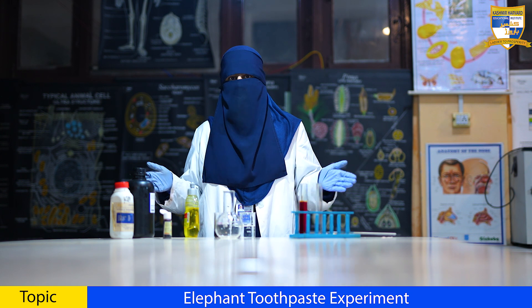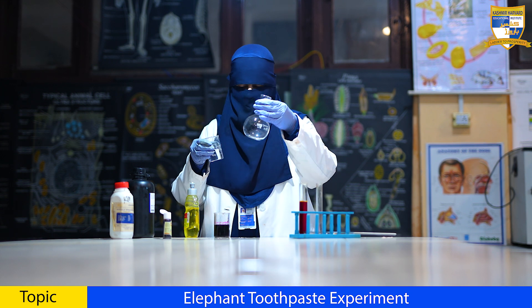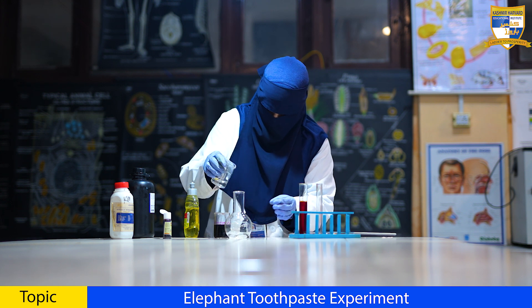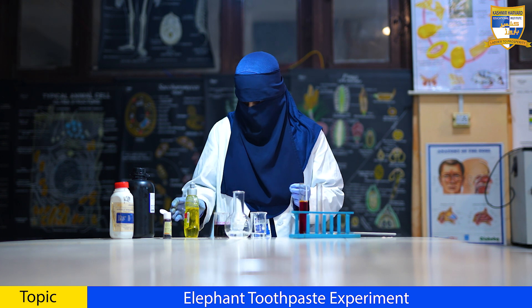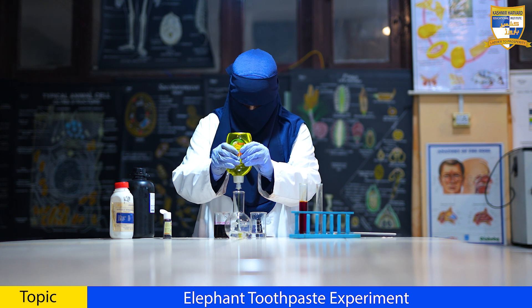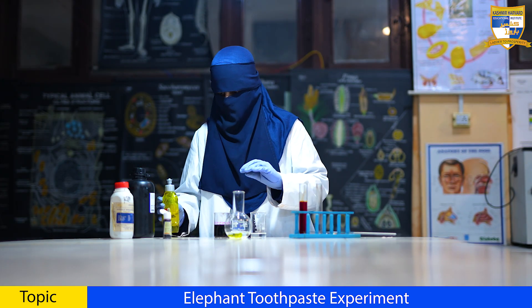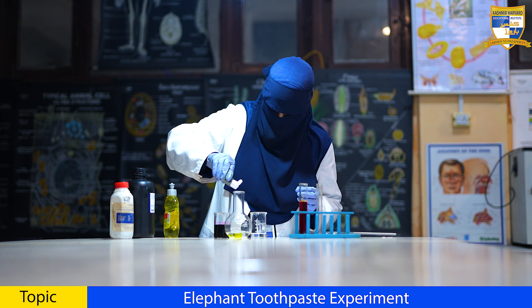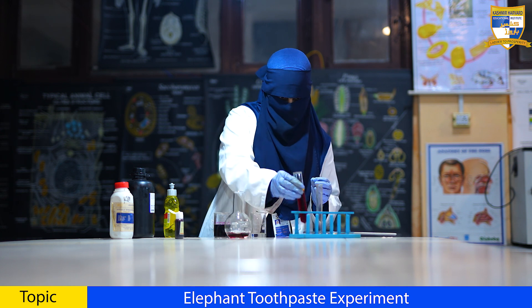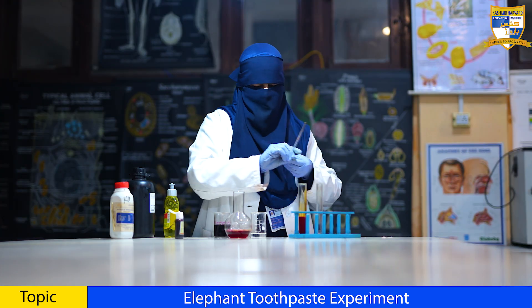When we mix these together, get ready for the magic to happen. First of all, I'll put some hydrogen peroxide into the round bottom flask. Now, I'll put a few drops of dish soap. Now, I'll add food colors. Now, let's mix them together.